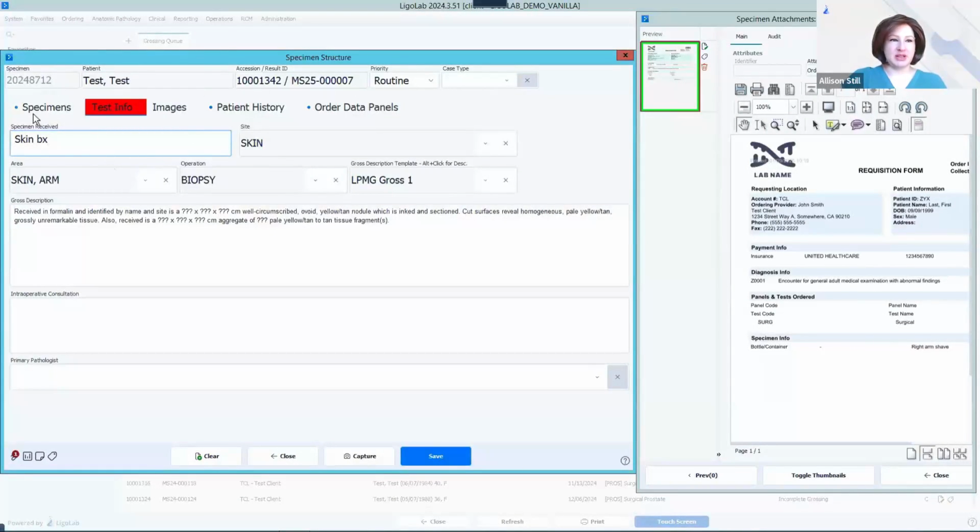At the top, you'll always have your patient identifiers, and then here we have our site-specific information that our accessioner selected. This information can be tied to downstream logic. In this case, we see it brought in a default macro for this case type. It might have also applied our histology protocol at order entry as we saw, and they probably also ordered a CPT, which is the default CPT for our biopsy, 88305.